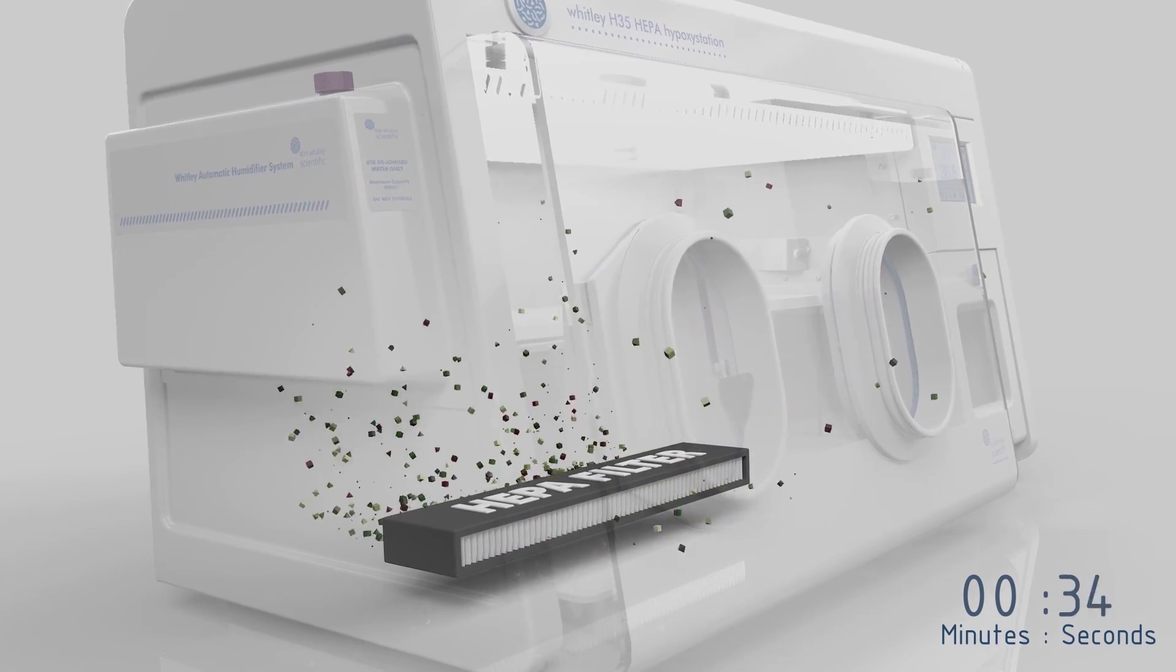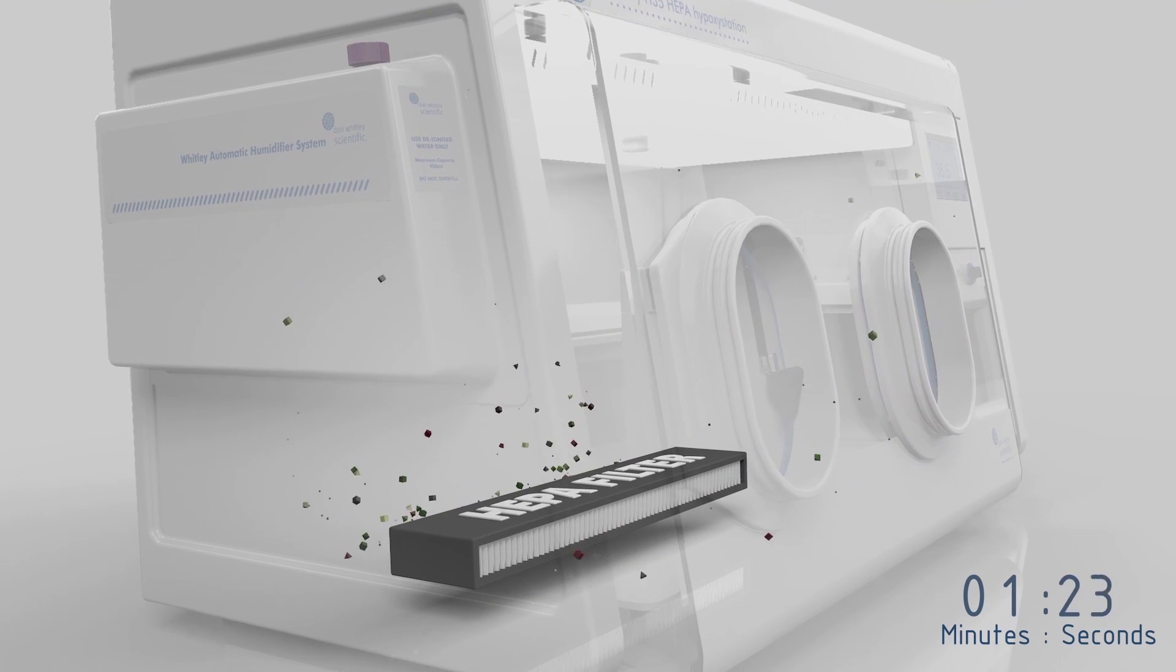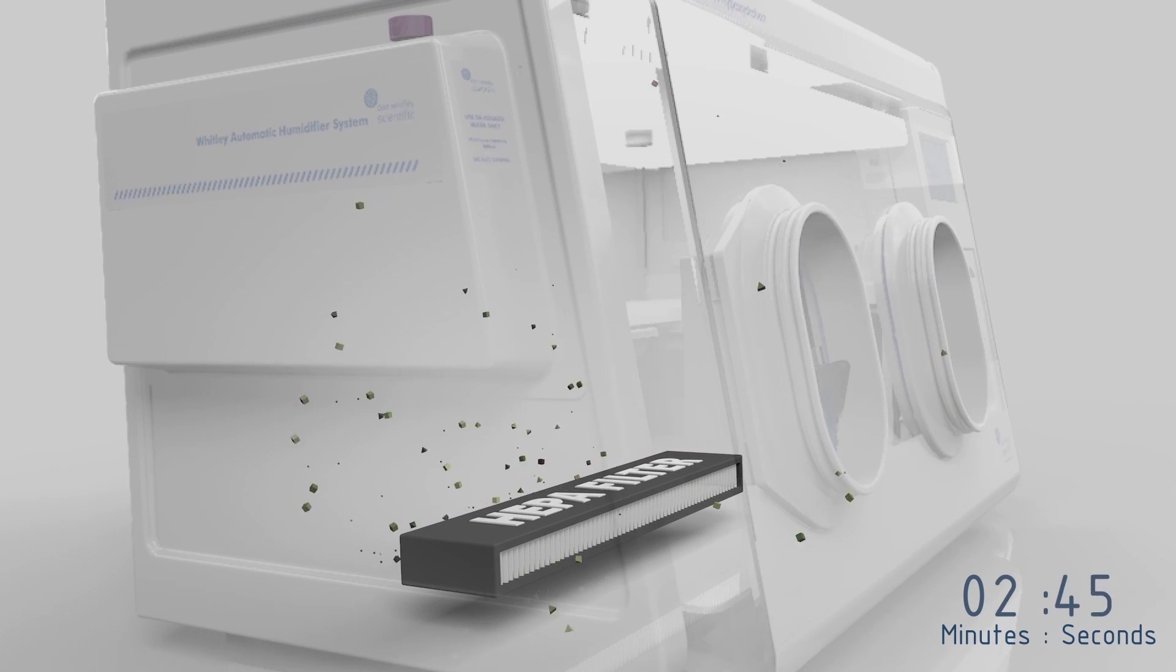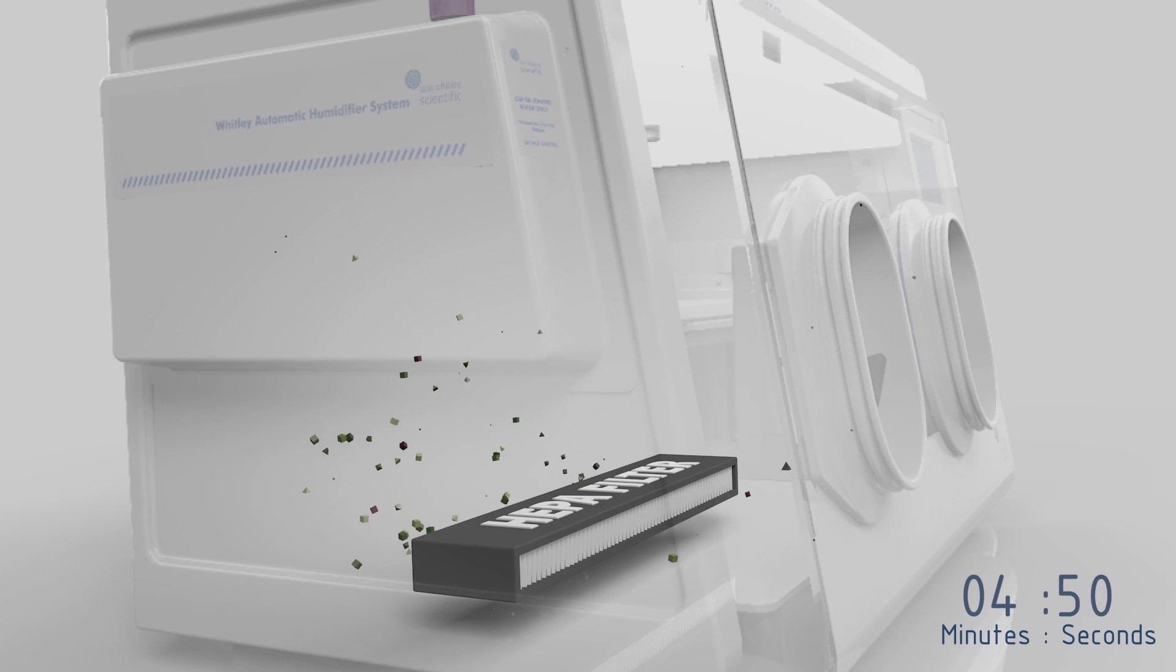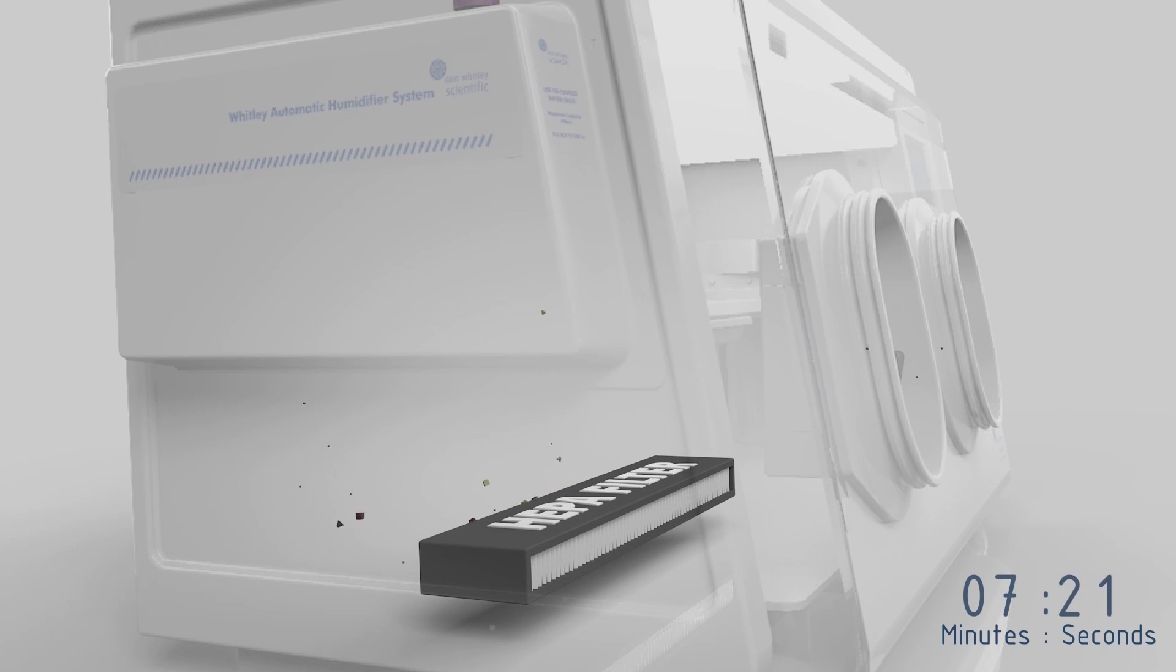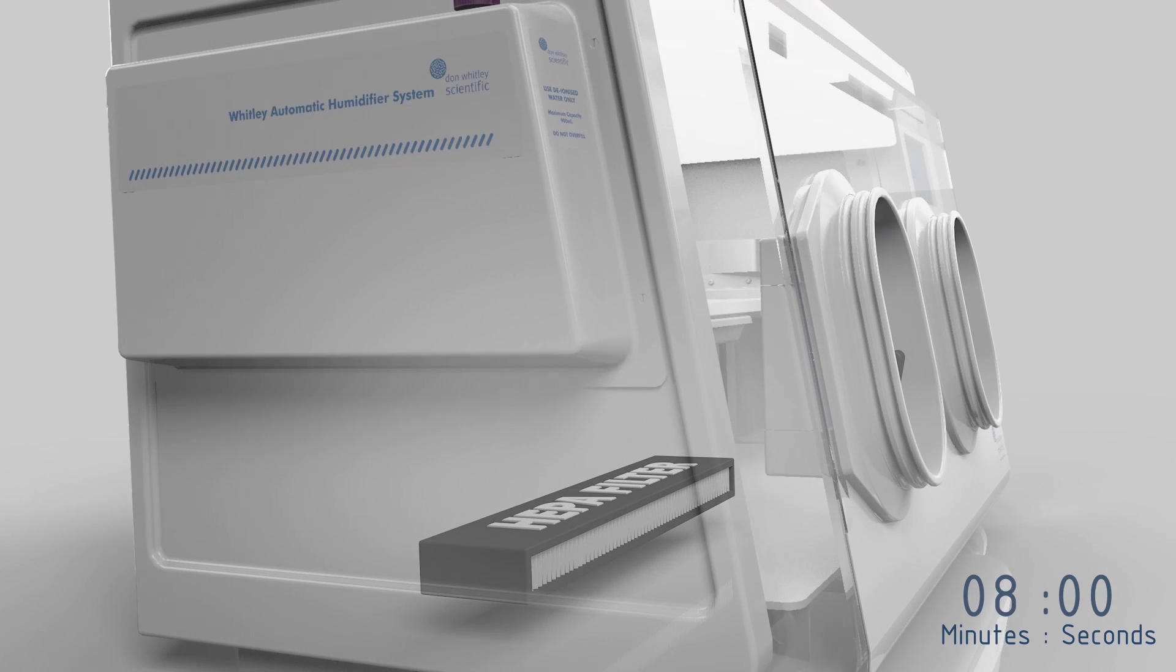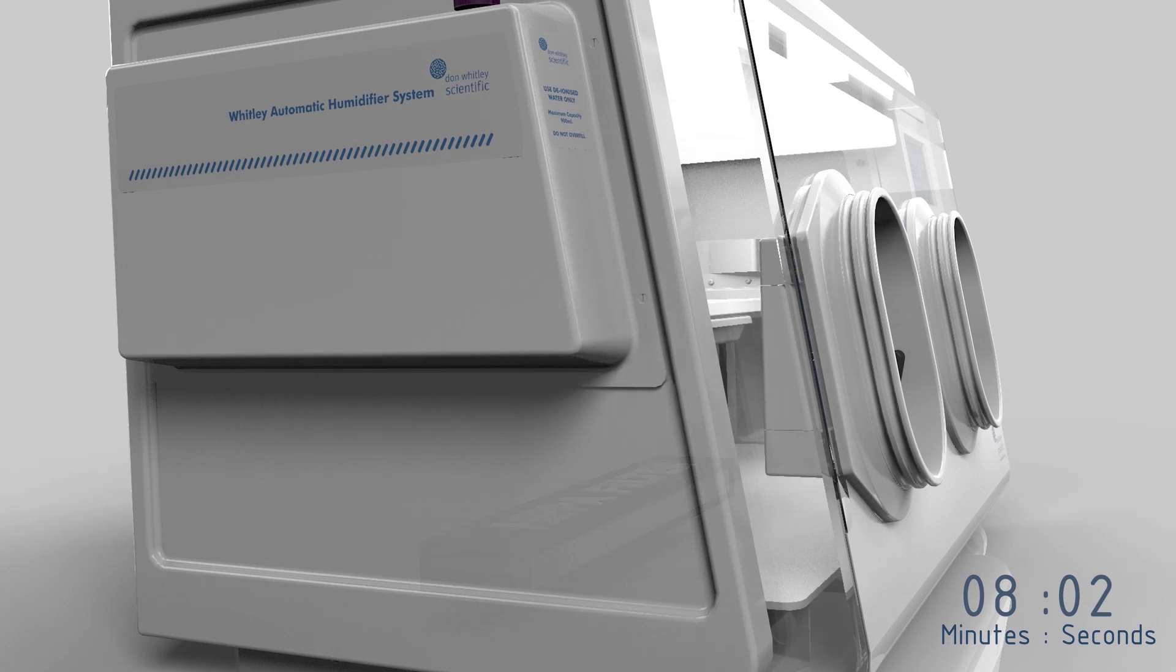There's also a laminar flow-like effect caused as the atmosphere passes through the filter. We've worked with one of the world's leading filter manufacturers to create a filter that is bespoke to our requirements. We place the filter inside the workstation. This ensures it remains dry, can never attract moisture, and never become saturated.